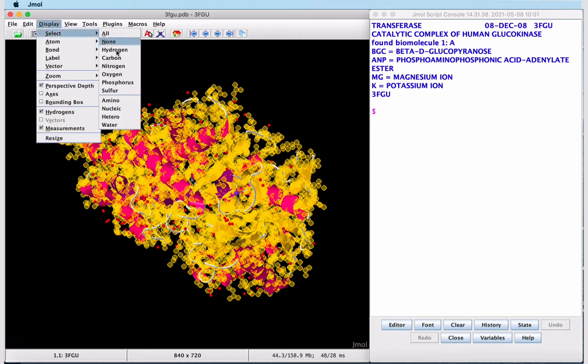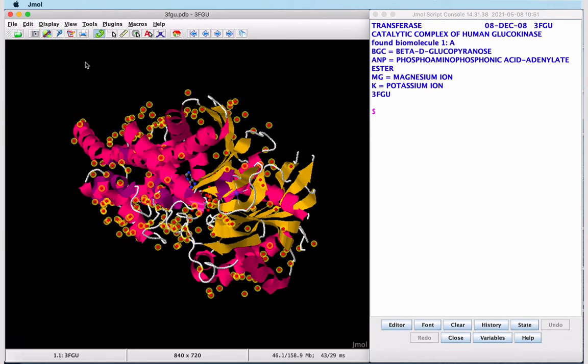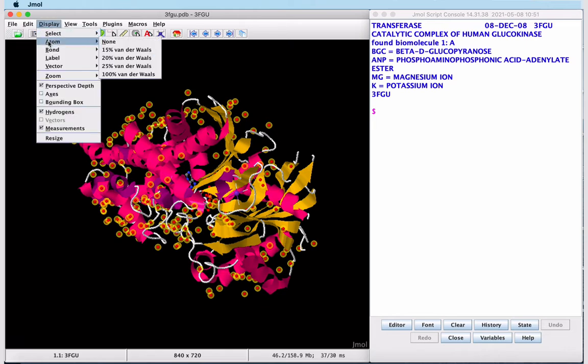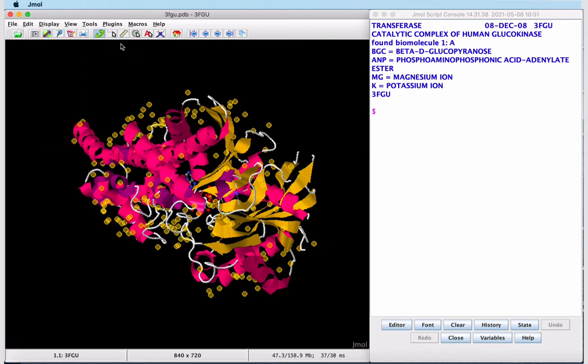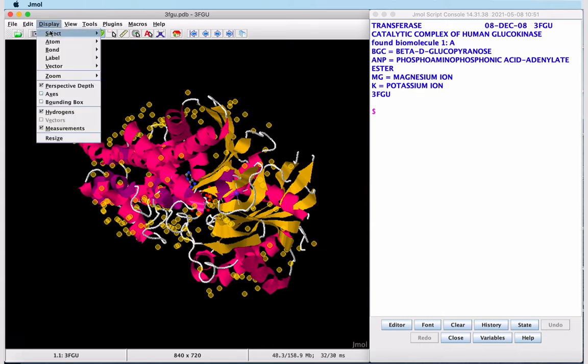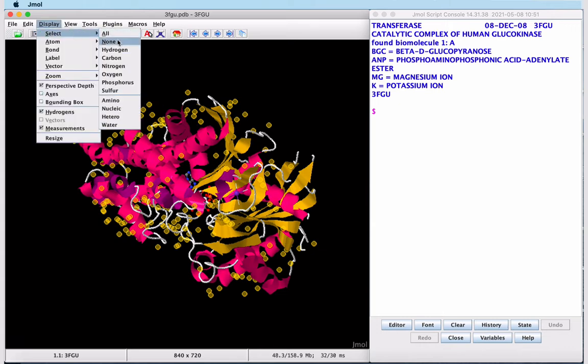Now we'll select Water Molecules. And we want to hide them all to start because we only want to show the water molecules within the active site. Display, Atom, None. They disappear and now we can clear our selection by Select, None.